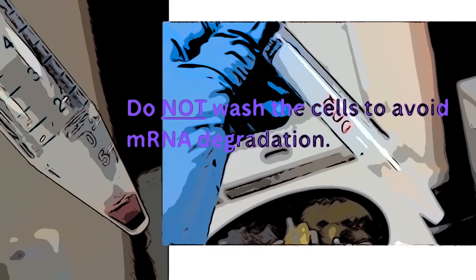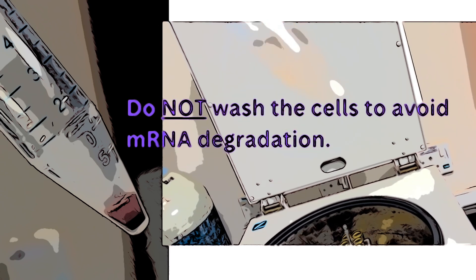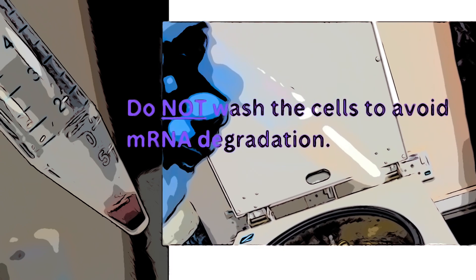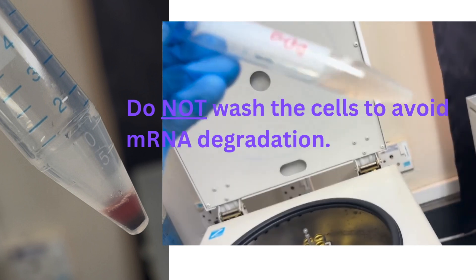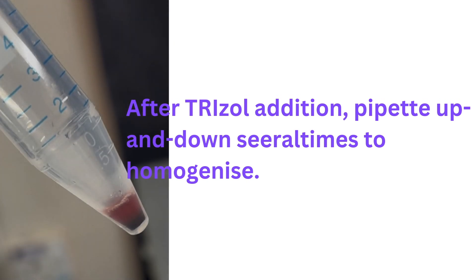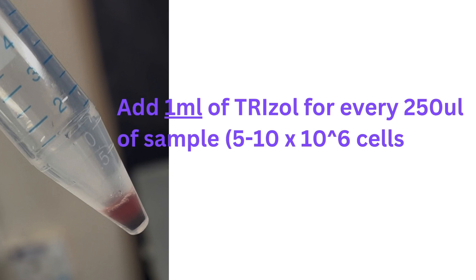Interestingly, you actually don't want to wash the cells before adding your TRIzol. Here what you see is my fraction of cultured cells that were frozen at -80°C, thawed on ice, and then spun to collect the cell culture pellet. I added 1 mL of TRIzol for every 250 microliters of sample — I had less than 250 microliters, so I added 1 mL of TRIzol. You also want to measure how many cells you're using in each extraction.